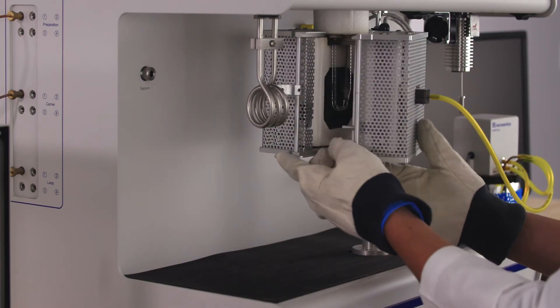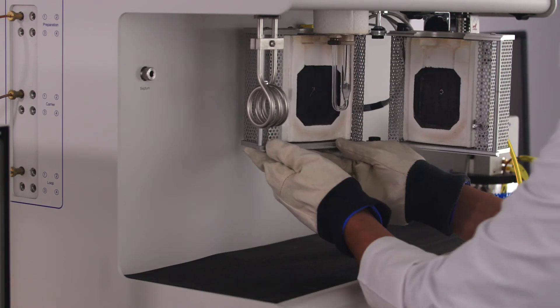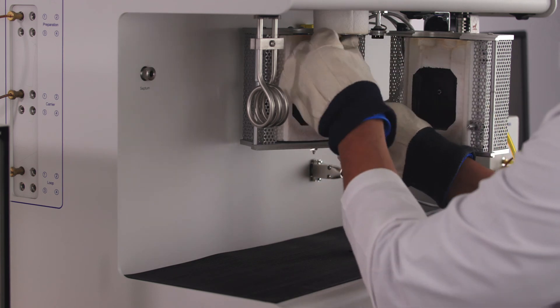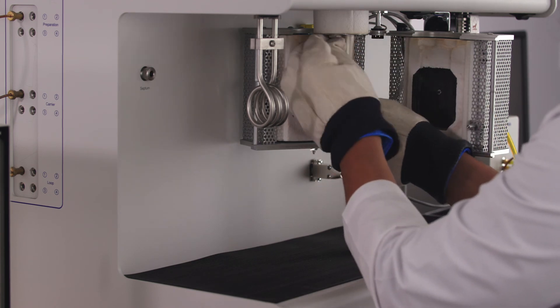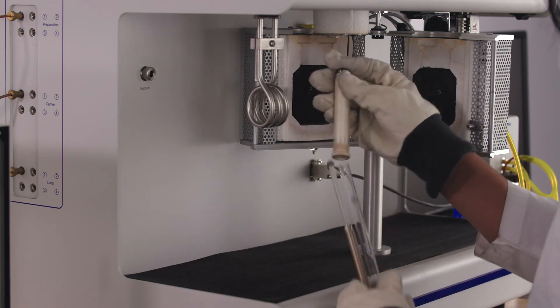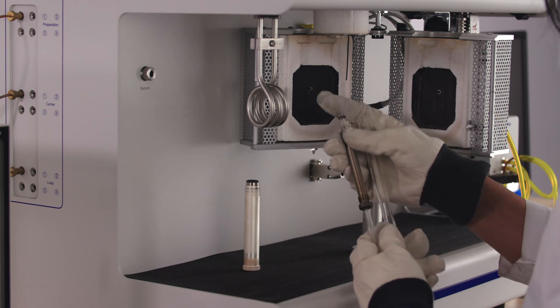After the analysis is completed, remove the sample tube with heat-resistant gloves. The sample port is kept at 110 degrees Celsius, so the sample tube will be very hot to touch. Carefully remove the sample tube from the furnace. Let the sample cool down for a few minutes.